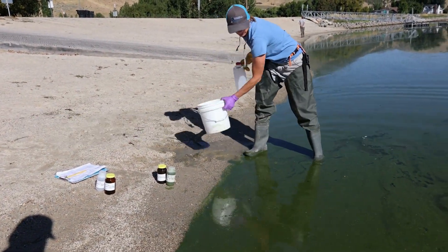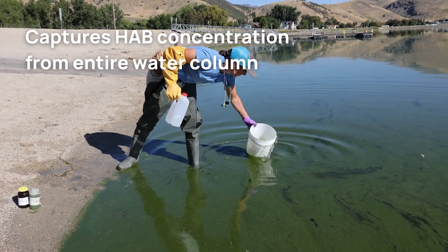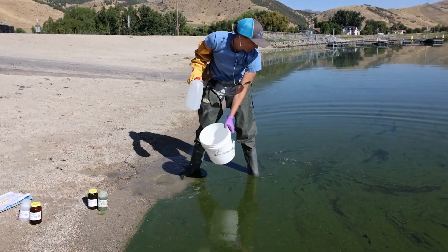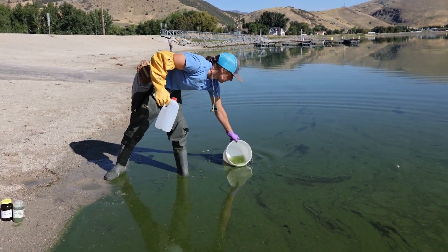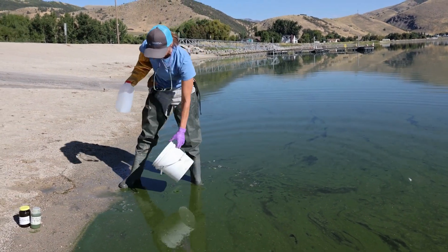Composite sampling aims to capture the HAB concentration from the entire water column. Begin by rinsing your collection bucket three times by dunking it in the water, swirling it, and dumping it away from the sample area. This will help clean out any debris or previous sample scum.